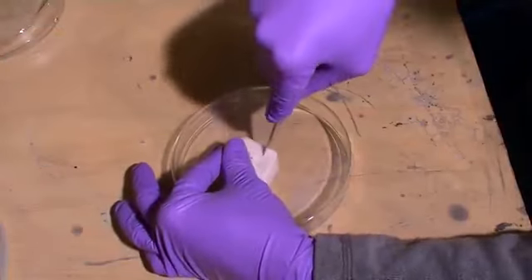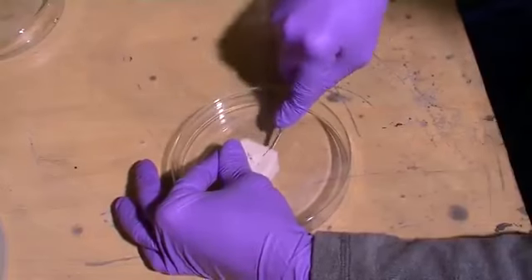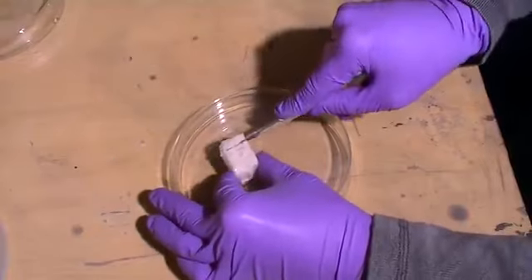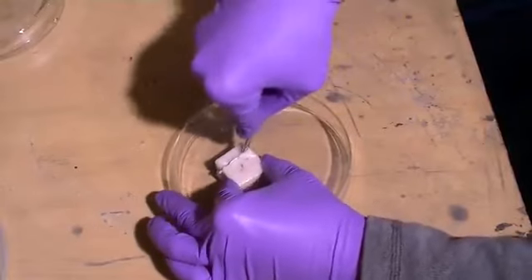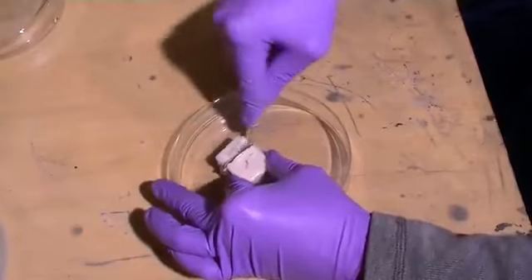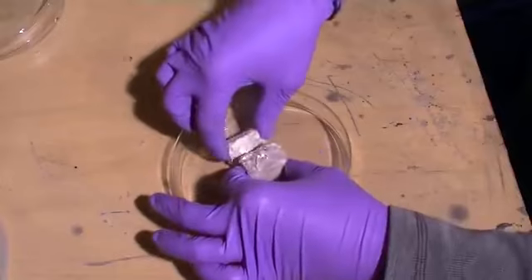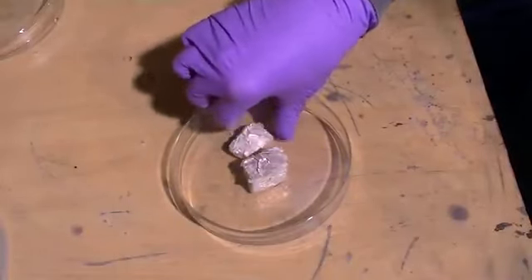And unlike most metals, sodium is relatively soft, so it can be cut with a scalpel, as shown here. You wouldn't be able to cut a block of iron as easily as this. When the sodium metal is cut, you can see a shiny metallic surface is exposed. The shiny surface created will rapidly tarnish in air due to the humidity, then form a dull surface.